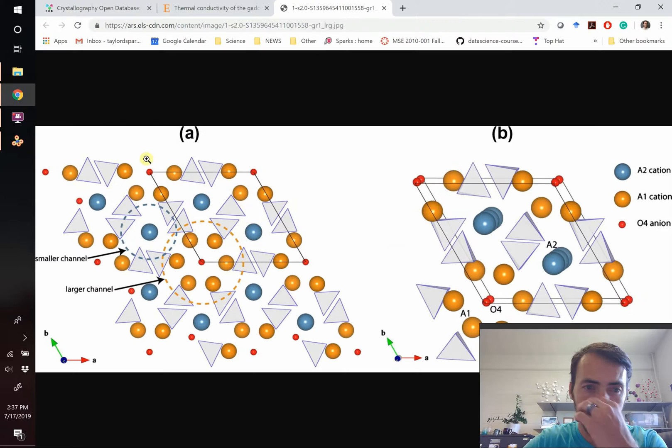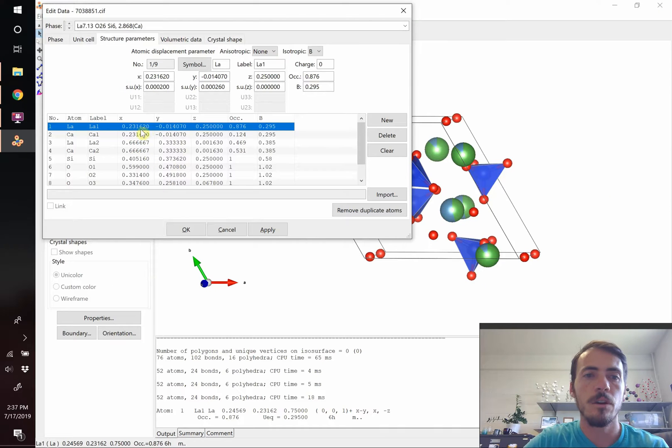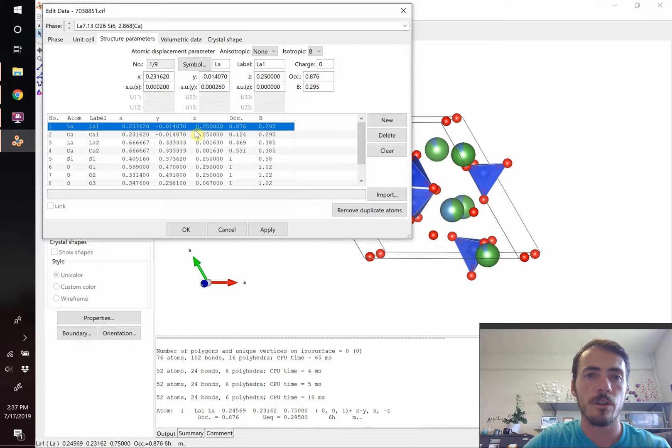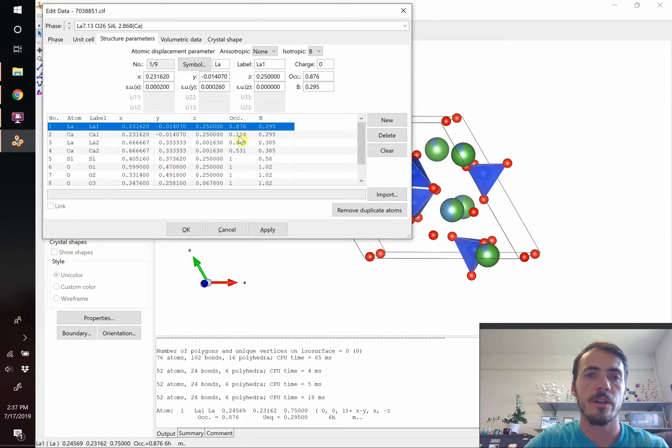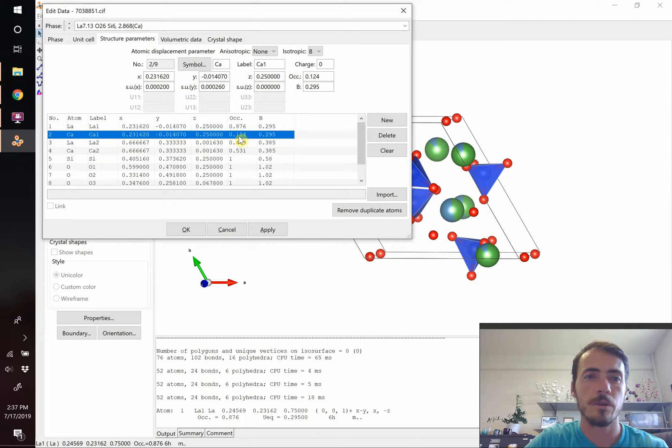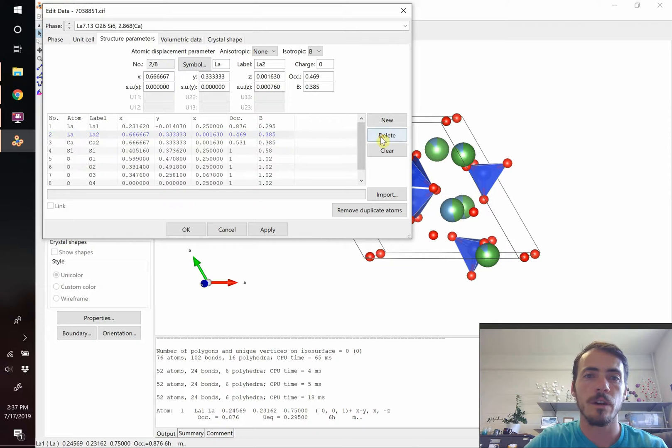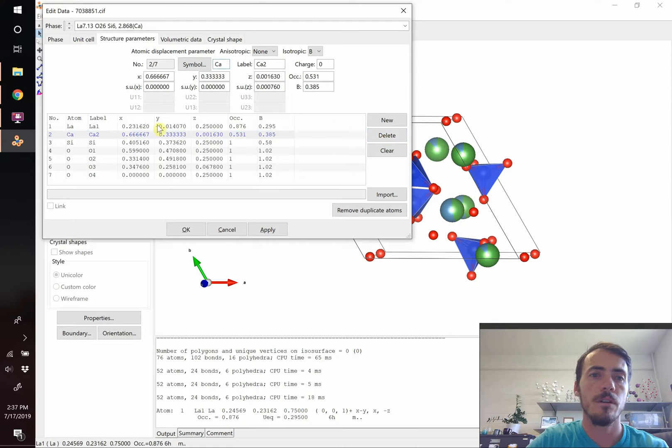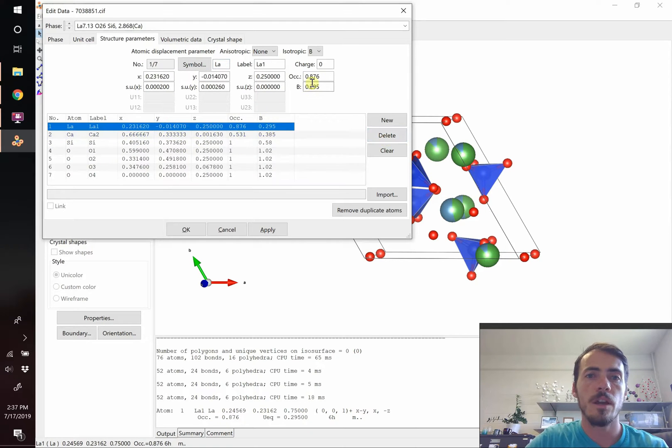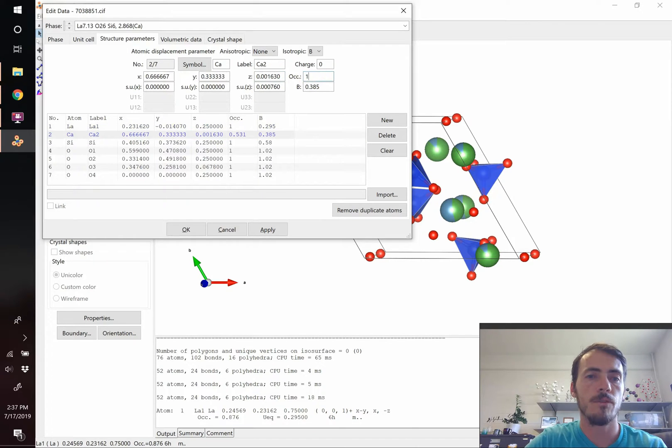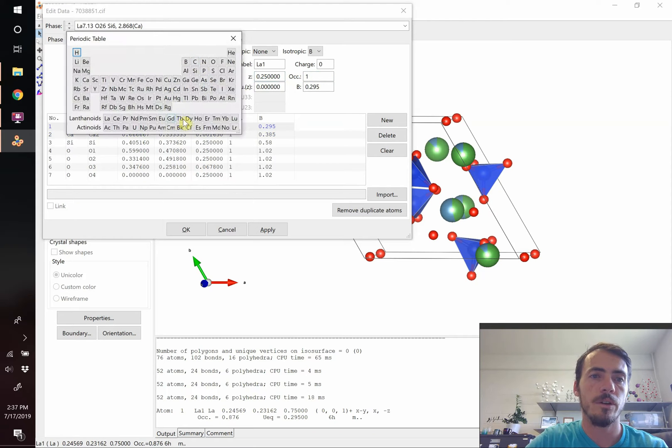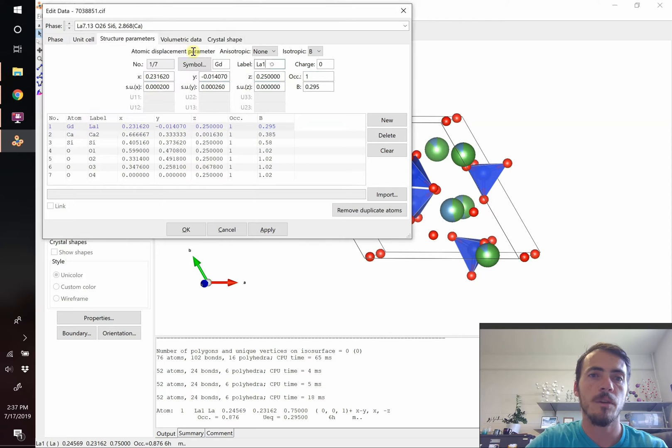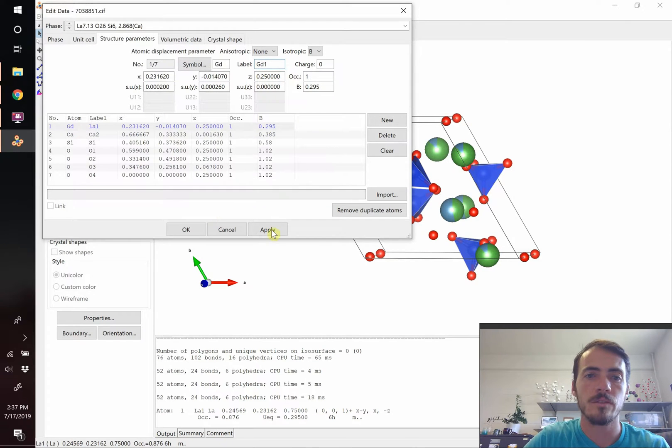So A1 in this one that we pulled the CIF card for, it has a shared occupancy, the calcium and the lanthanum are sharing that site. But in our image, we want to show that it's the rare earth that dominates that site, so we're going to remove this one entirely. We're going to do the same thing for the two sites, but now we're going to remove the lanthanum site. We're going to change these occupancies to reflect now 100% occupancy for both of those two sites. And then we're going to change it from lanthanum to gadolinium. So we're going to go over here and select gadolinium and change the label to gadolinium one. We could call it A1 and A2, it doesn't matter, it's just a label.